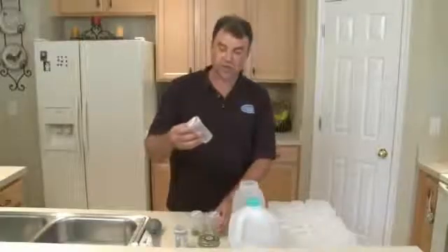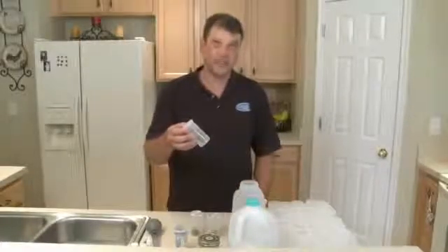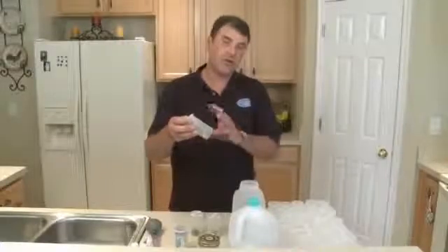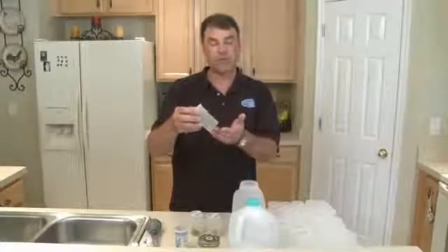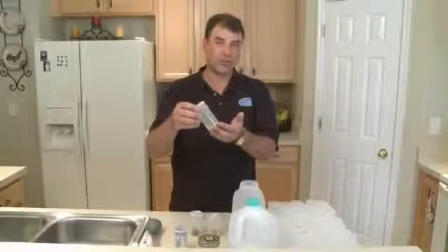Here is also a yellow iris, one of our favorites. Again, this started as a single plant and in the period of about four or six weeks it has multiplied out at least a dozen times, so we could really have 12 new plants out of this if we wish, growing on the same gel of sugar, nutrients, hormones, and agar.